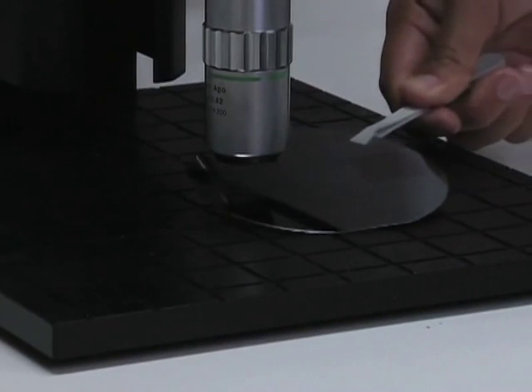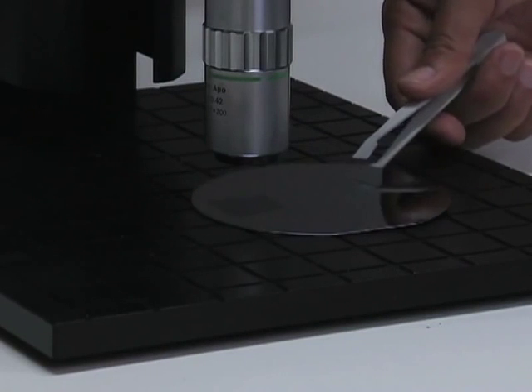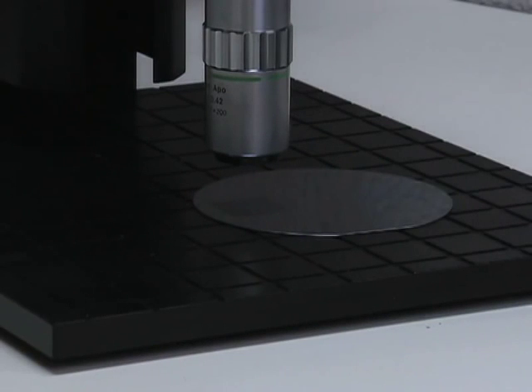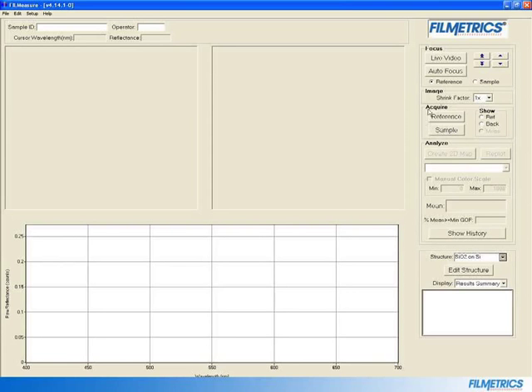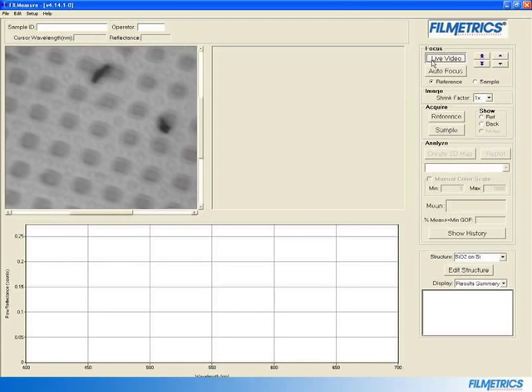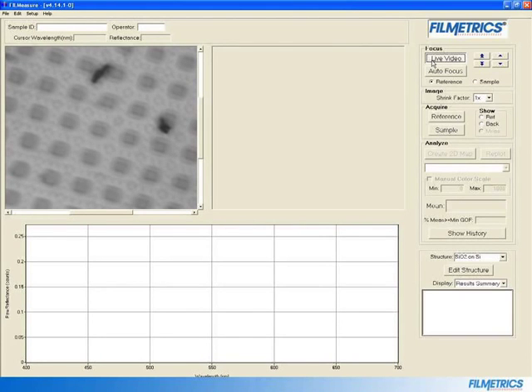Place the SiO2 on Si focus reference wafer on the stage so that the focus portion of the wafer will be imaged. Now click on Live Video. This will turn on the camera so that an image of your sample will be acquired.